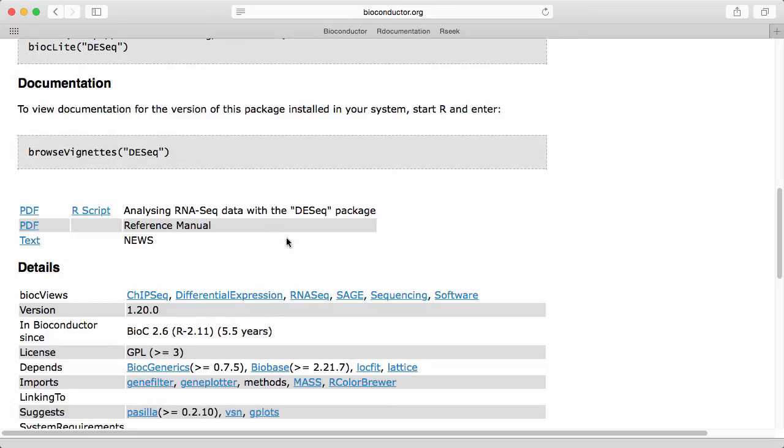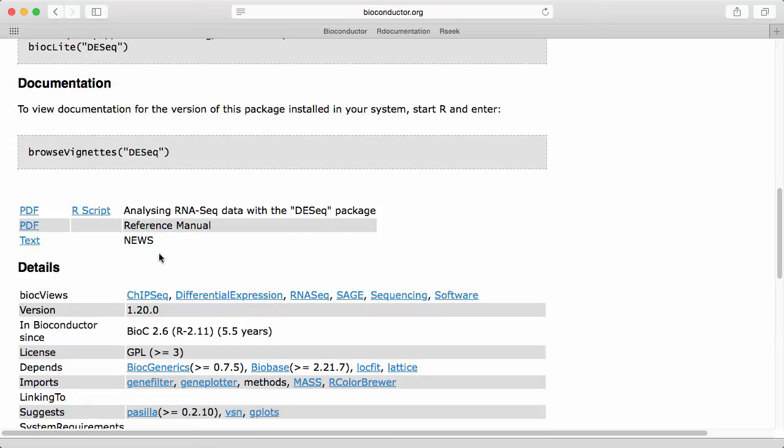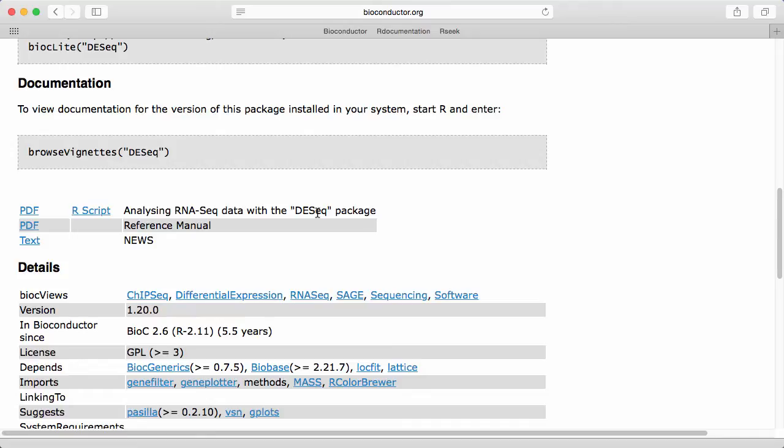But most importantly under the documentation tab here I can see a list of vignettes and news files. In this case the package has a single vignette which is called analyzing RNAseq data with the DESeq package. Package vignettes is something that belongs in all R packages but Bioconductor has mandated that software packages have a vignette and this is really the first place to go for information about a given package. Some packages have very short vignettes, some packages have extremely long vignettes, sometimes hundreds of pages and some packages have many different vignettes.